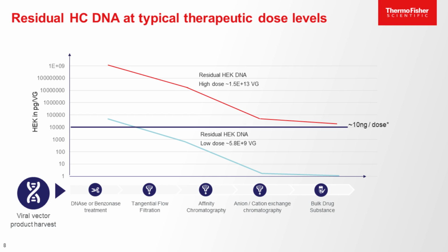On the other hand, we hear fairly frequently, unfortunately, from customers that are using digital PCR platforms, and they have a self-developed assay that they try to quantitate residual HEK host cell DNA by targeting just a single gene, often even just a single copy, sometimes just a few copies. And we really highly recommend to not fall into that trap, as a single target with a single copy, like E1A, is not sufficient to reliably quantitate total HEK host cell DNA, right? Especially at lower levels. That's when you really see a difference in results.